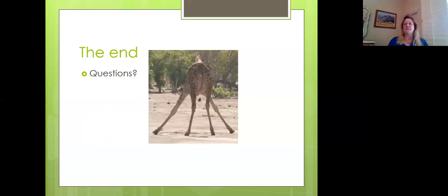So that's the basics of how to go about utilizing the cryostat. Don't forget to go back and watch those videos that I've embedded in your PowerPoint for you. And happy studying, happy frozen sectioning. And the next lecture that you need to watch is the frozen section special stain lecture. Bye for now.